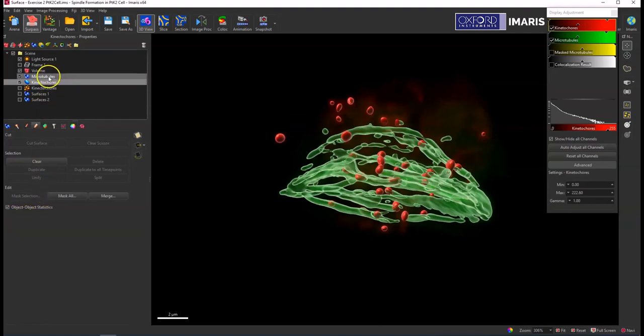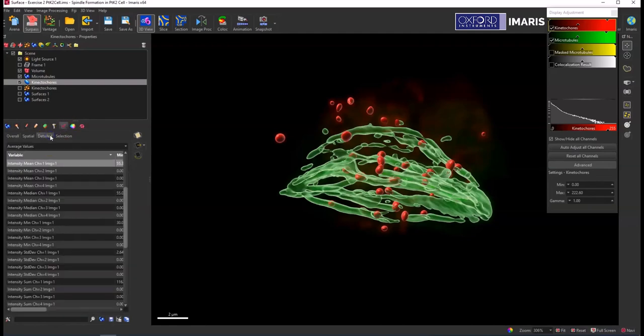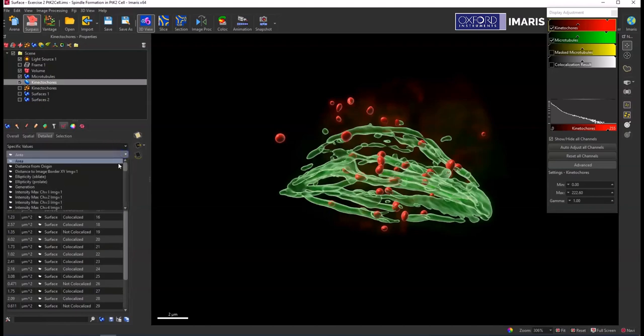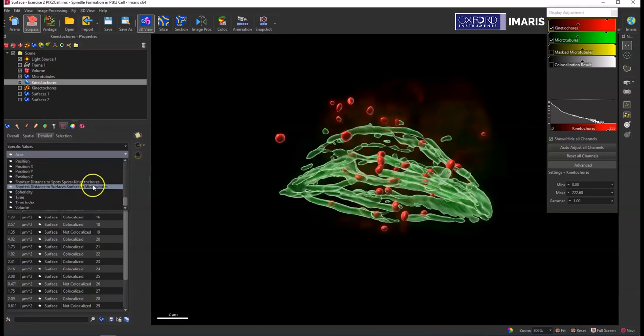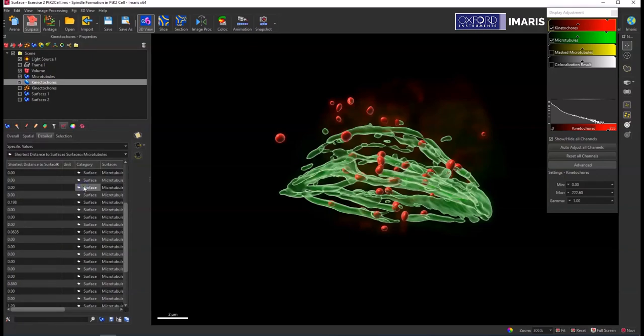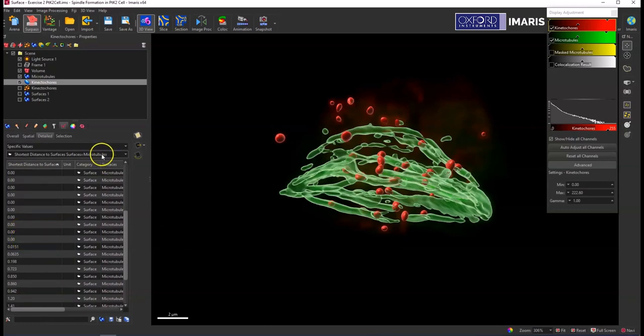And once these object-object statistics are enabled you can then go to the statistics tab, select detailed, and then there's a bunch of different object-object statistics that you can look at and have generated. So if I just go to the detailed tab specific values, there are a few different options. We can look at the shortest distance to surfaces on the microtubule surface, and so then anything that is zero microns or less will be touching or within whatever surface that I'm comparing it to.